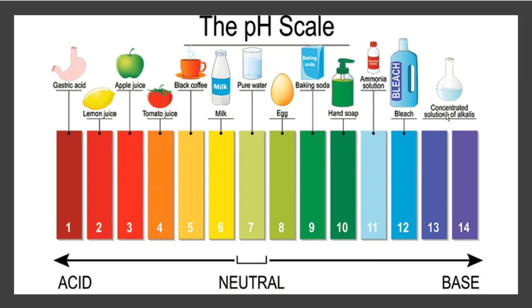The concentrated solutions of alkalis that you see on the right-hand side of the screen here, the alkali is a term that just simply means base. That's all that really means. Fancy term, again, it's all words, it's building vocabulary, and concentrated solutions of alkalis is just concentrated solution of a base. That's all that means.